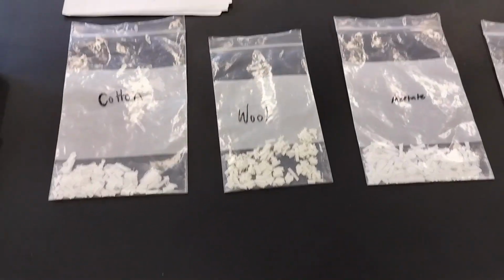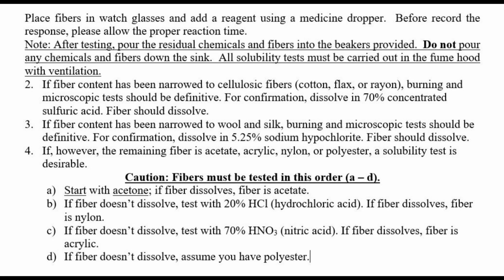Before starting the test, it is important to understand which fiber dissolves in which chemical.